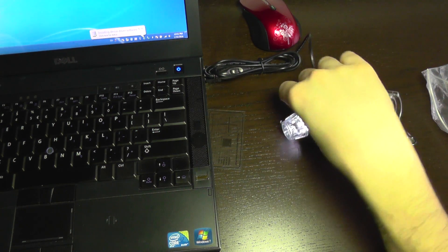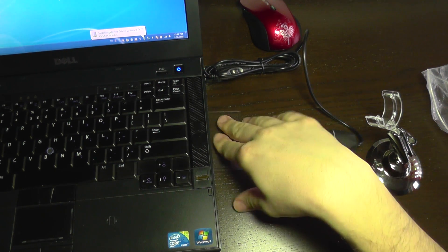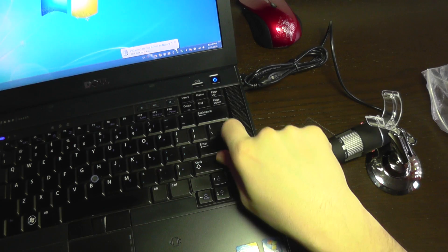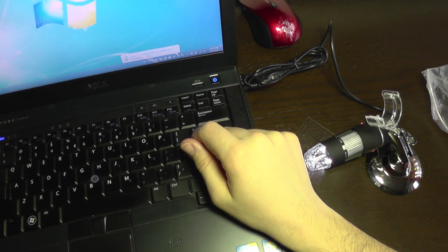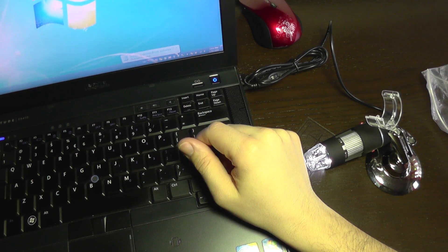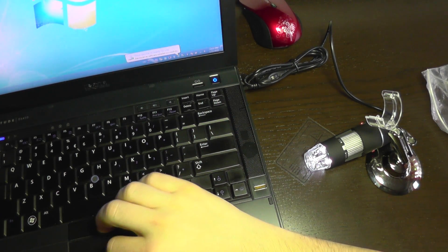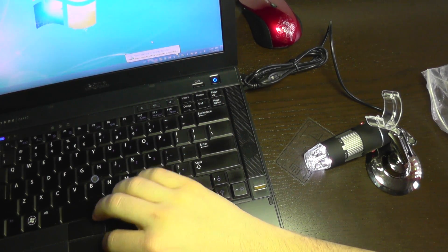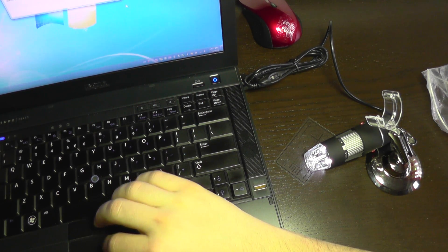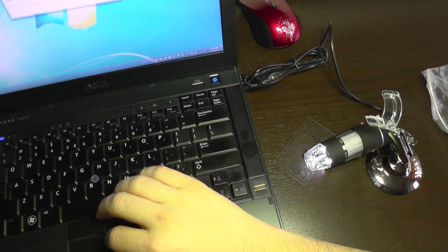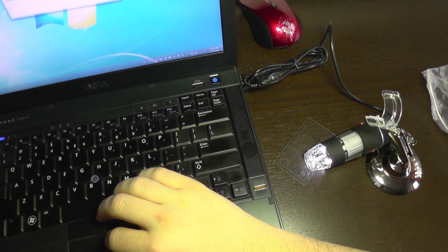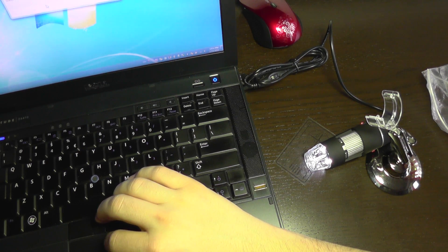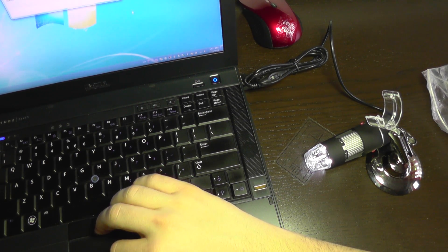The light turns on and Windows is saying that it's installing drivers and that my device is ready to use and it's a USB composite device and a PC camera.